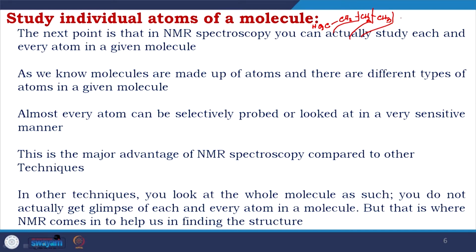Similarly, you could differentiate if there is a hydroxyl group. With other techniques, it is not that they do not identify, they identify the functional groups and all, but this identification of each and every atom and their change in the chemical environment is the speciality of NMR, which we are going to discuss in great detail.